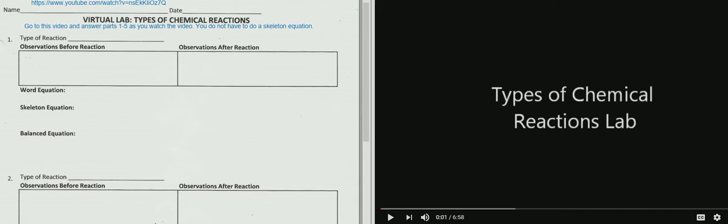G's lab, and we are going to be basically going over the types of chemical reactions.